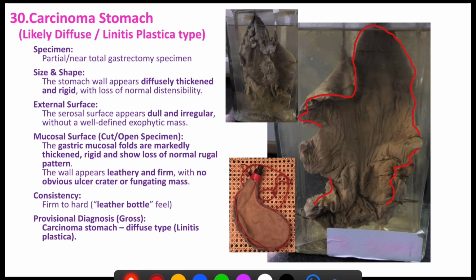So this is called leather bottle appearance of stomach or linitis plastica type carcinoma stomach.